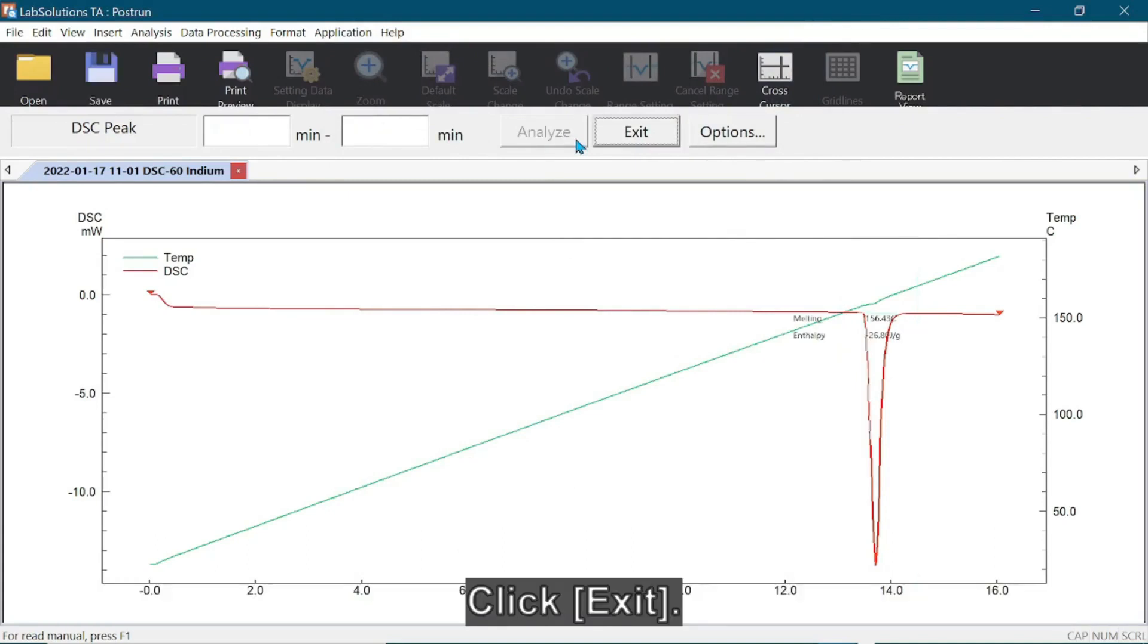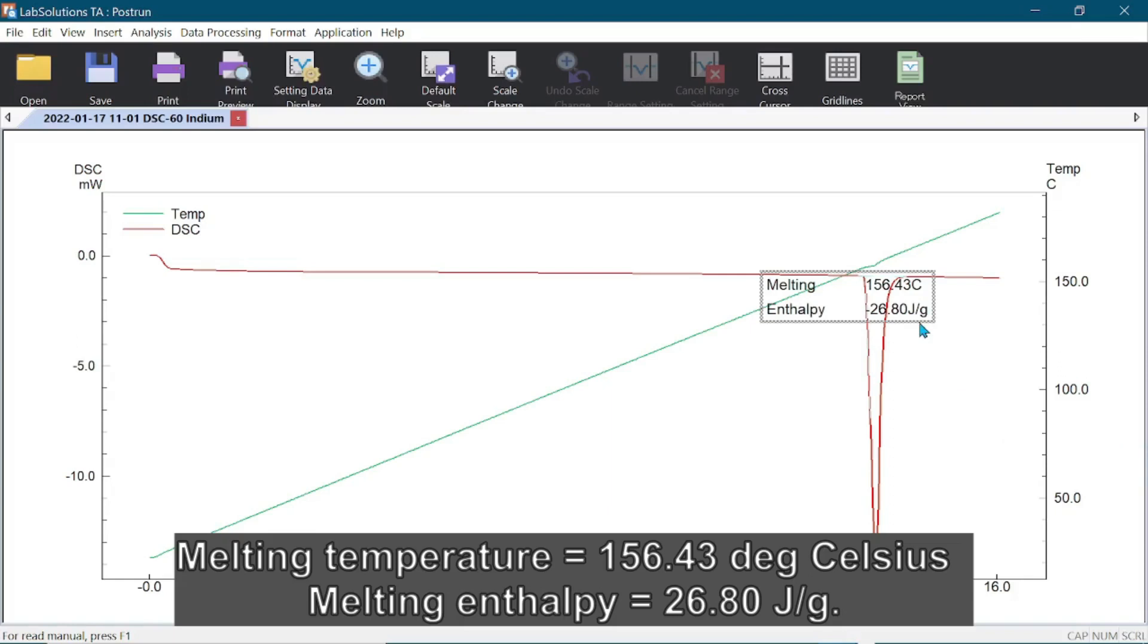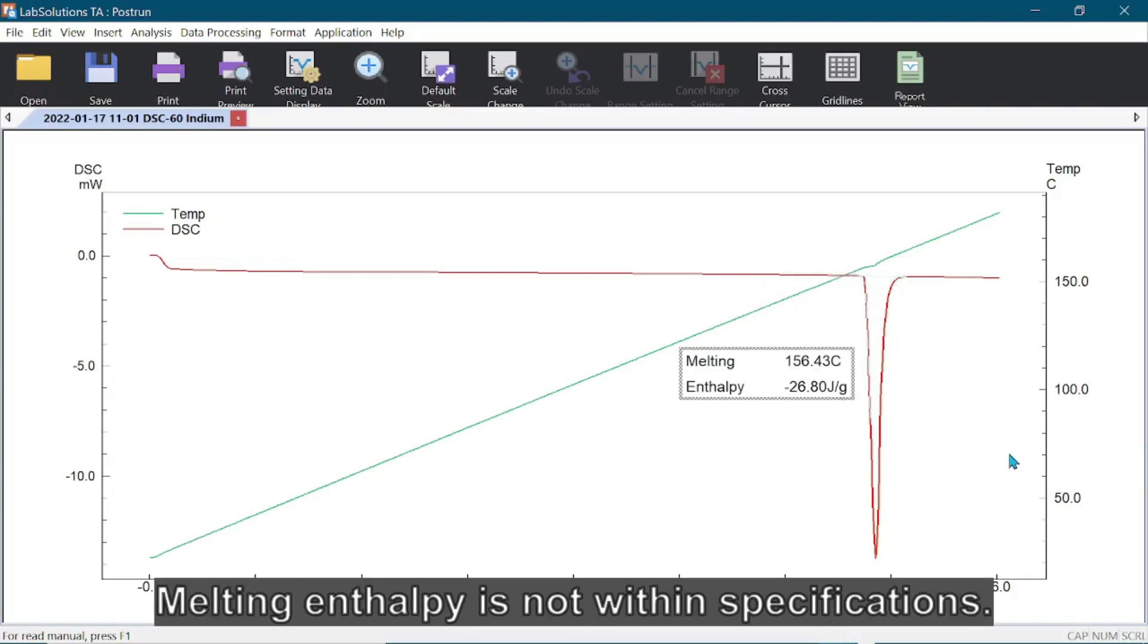Click Exit. The melting temperature was 156.43 degrees Celsius, whereas the melting enthalpy was 26.8 joules per gram. As the melting enthalpy is not within specifications, the DSC should be calibrated.